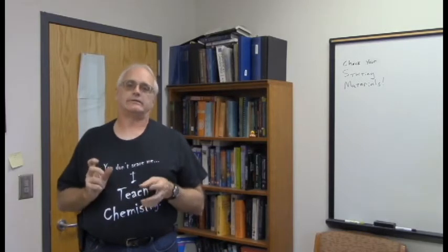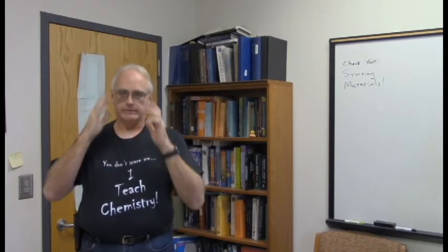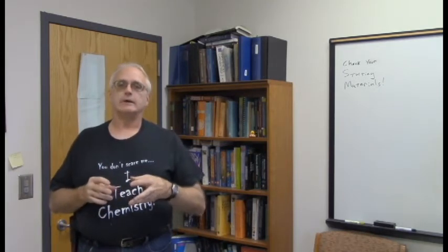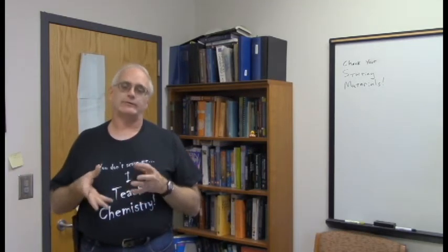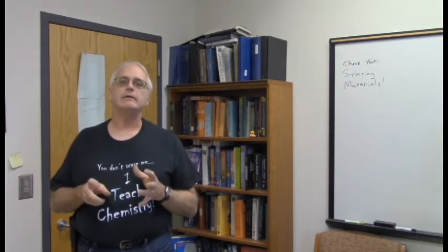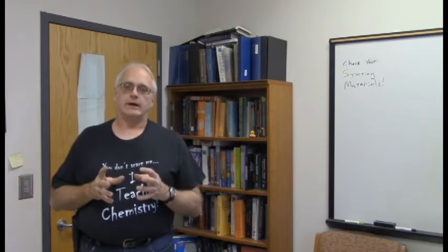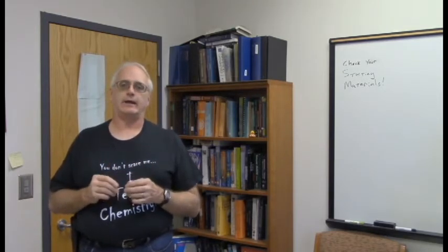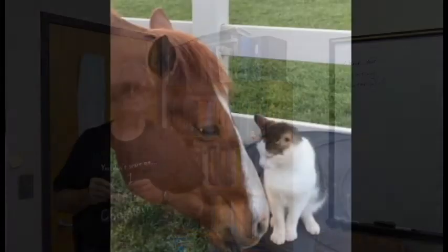And so to get ourselves in the right frame of mind, to be able to look at the structure of FMOC and figure out what we should expect to see and whether the spectra we obtain truly match FMOC or not, we're first going to do as we often do, try to relax and take a look at a picture of a cat and a horse.